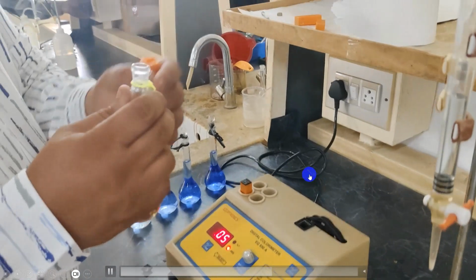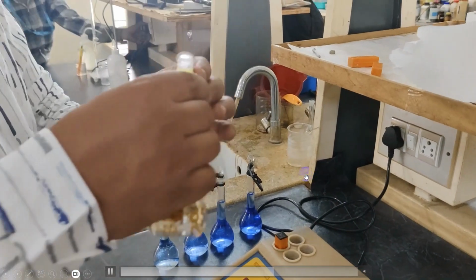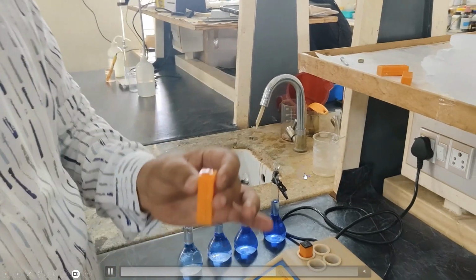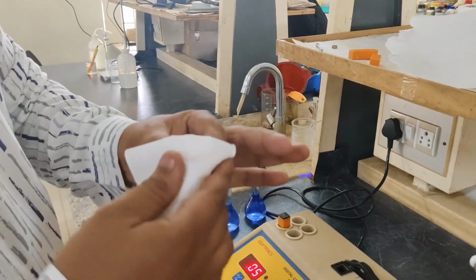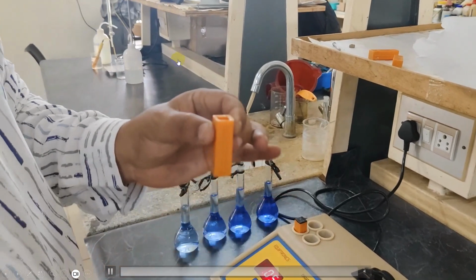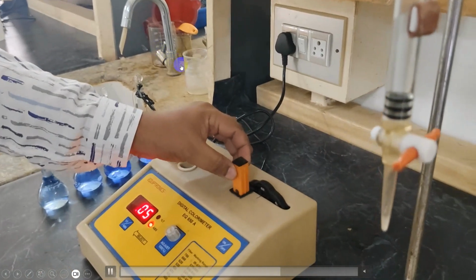Once set to 0 with distilled water, again fill the cuvette with the blank solution. Blank means the one which does not contain copper sulfate, only ammonia and water. Now place it back in the sample holder and again ensure the 0 absorbance.